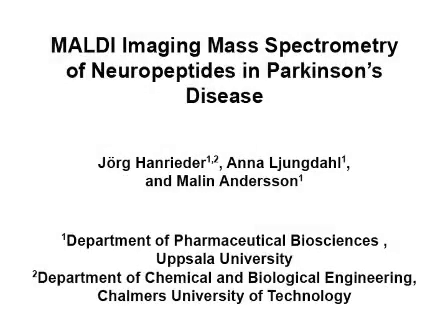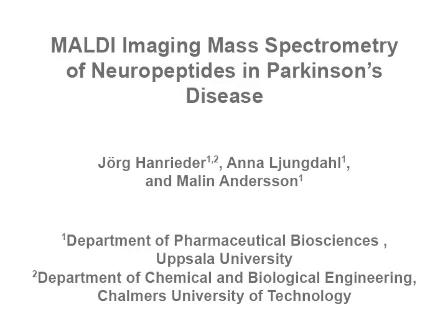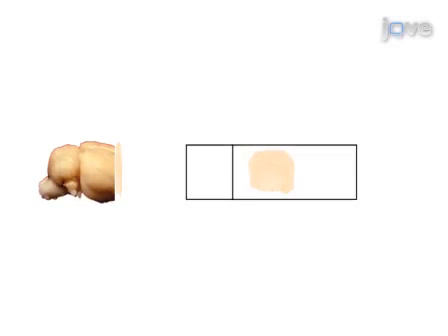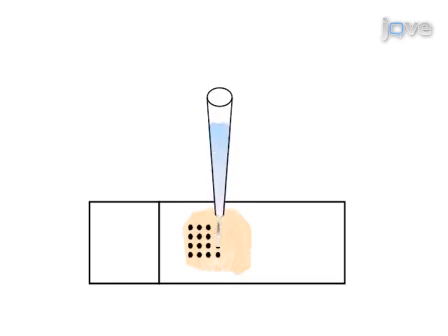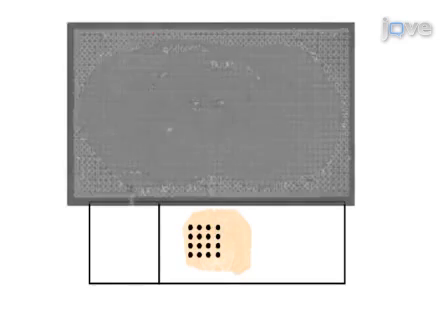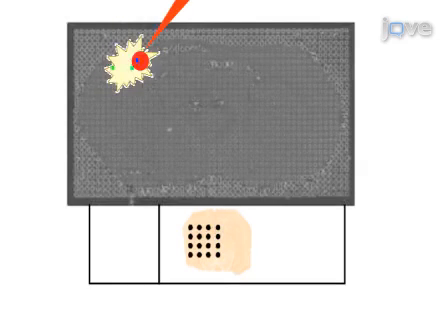The main aim of this procedure is to elucidate the spatial distribution of neuropeptides, specifically opioid peptides, directly in thin brain sections using MALDI imaging mass spectrometry. This is accomplished by first collecting 12 micrometer thin tissue sections of snap-frozen rat brain and thaw mounting them onto conductive glass slides. The second step is to apply MALDI matrix in arrays across the sections using a chemical inkjet printer and then acquire one mass spectrum from each matrix spot.